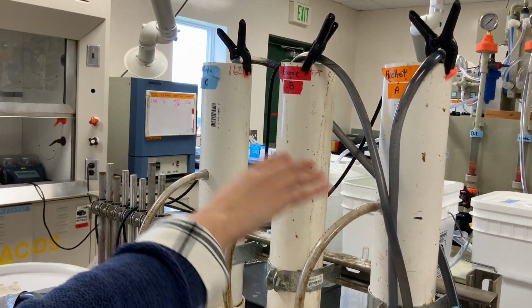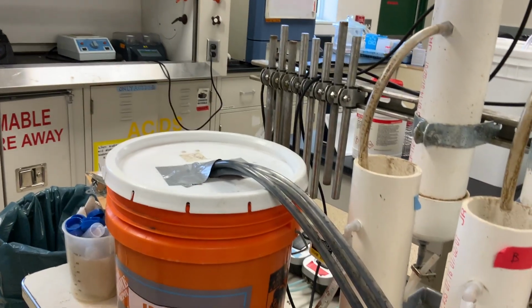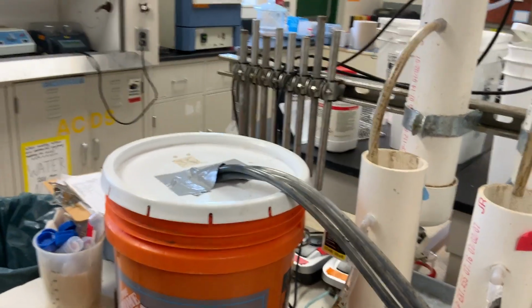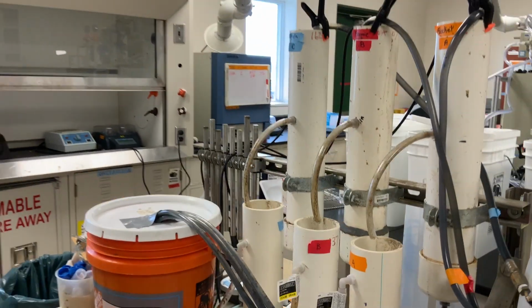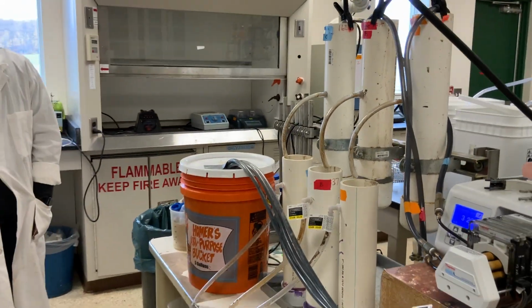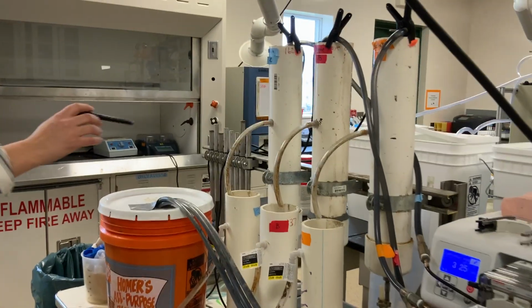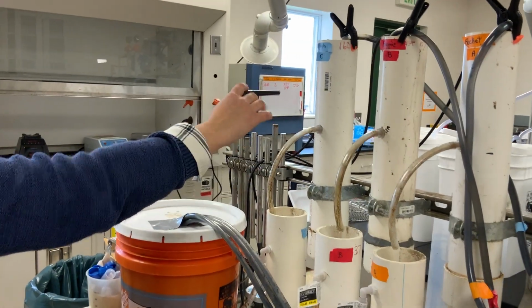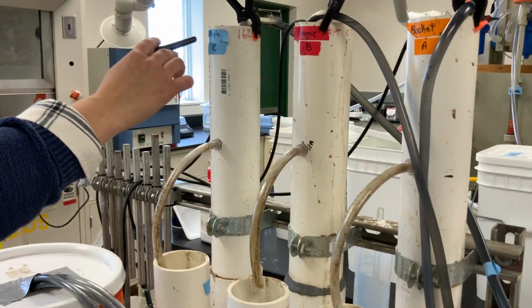Inside each of these is an aeration stone connected to one of the pumps on the other side. Air is pumping through this continuously, and I measure dissolved oxygen every day just to make sure they're getting between 6 and 7 milligrams per liter consistently. In this aeration tank, again, is the activated sludge, and the wastewater is pumping in the top over here.